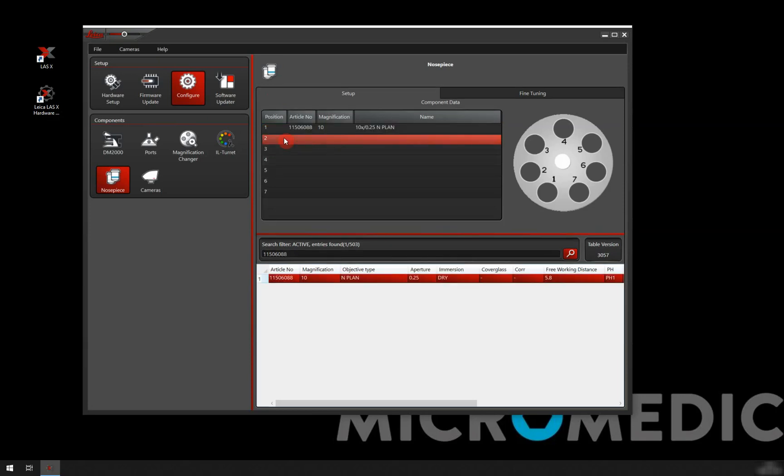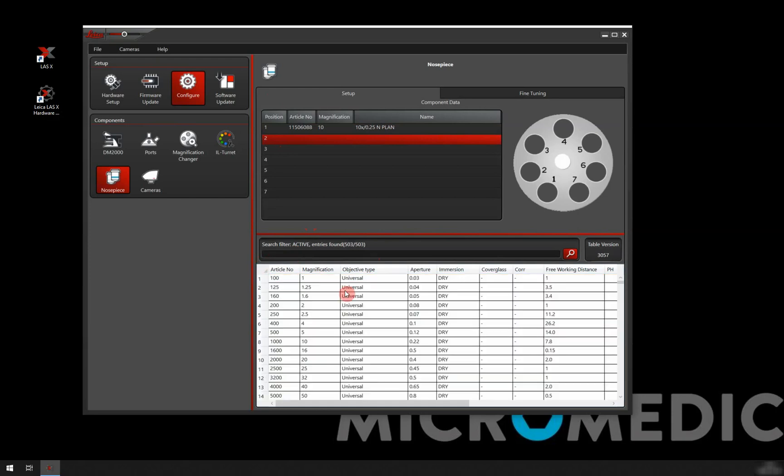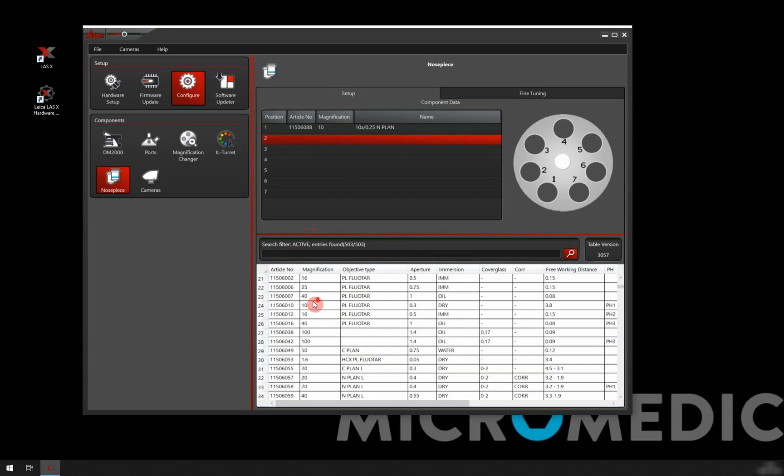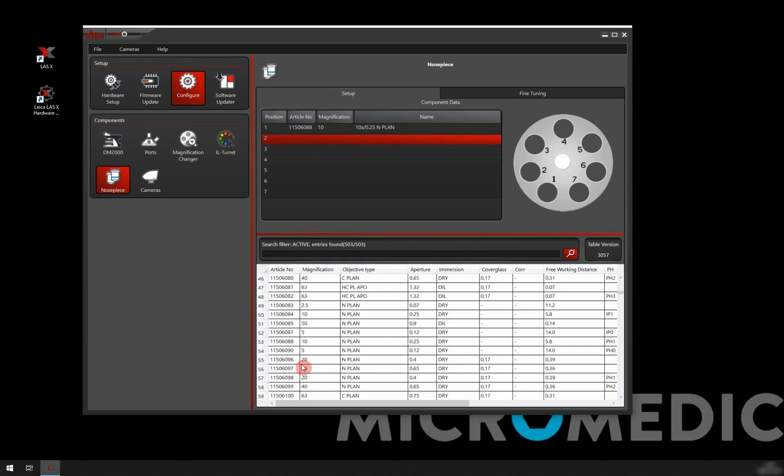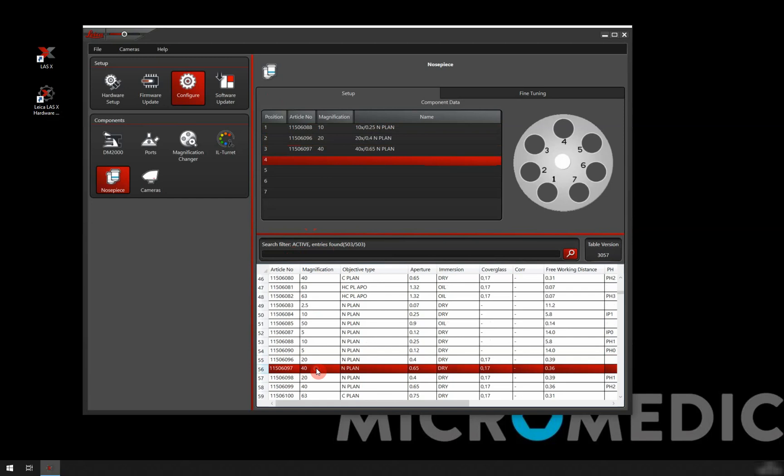It automatically skips to position two. So now I need to find the next one. I would type that article number in. But in this case, I'm just going to scroll down to the N Plan and I will add the 20x and the 40x to that. That's what I have on this microscope.